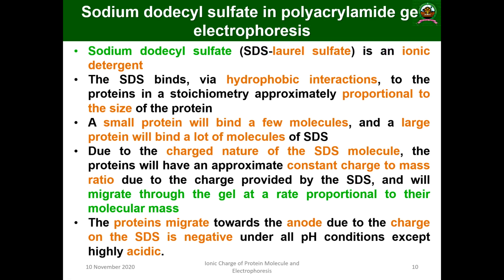Okay, why are we using this anionic detergent? That is a question. SDS binds via hydrophobic interaction to the protein in a stoichiometry approximately proportional to the size of the protein. So a small protein will bind a few molecules and a large protein will bind a lot of SDS. Due to the charged nature of the SDS molecule, the protein will have an approximately constant charge to mass ratio.